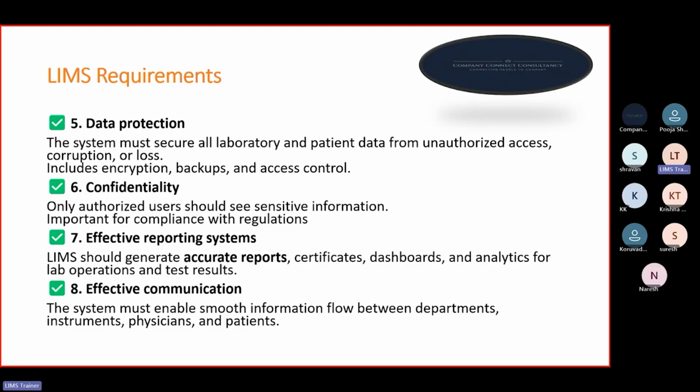There will be very few chances of misbehavior with the software or tampering with the data. Whatever accurate results there are will be captured, accurate reports will be generated, and certificates will be provided, along with dashboards and analytics for the lab operations.